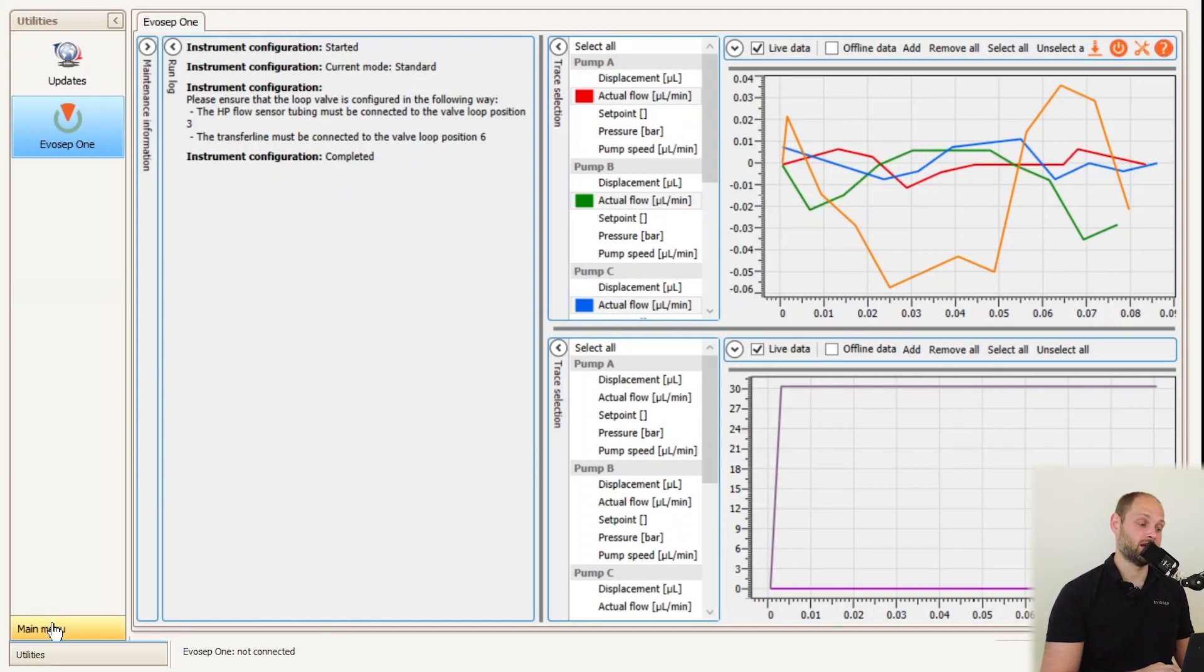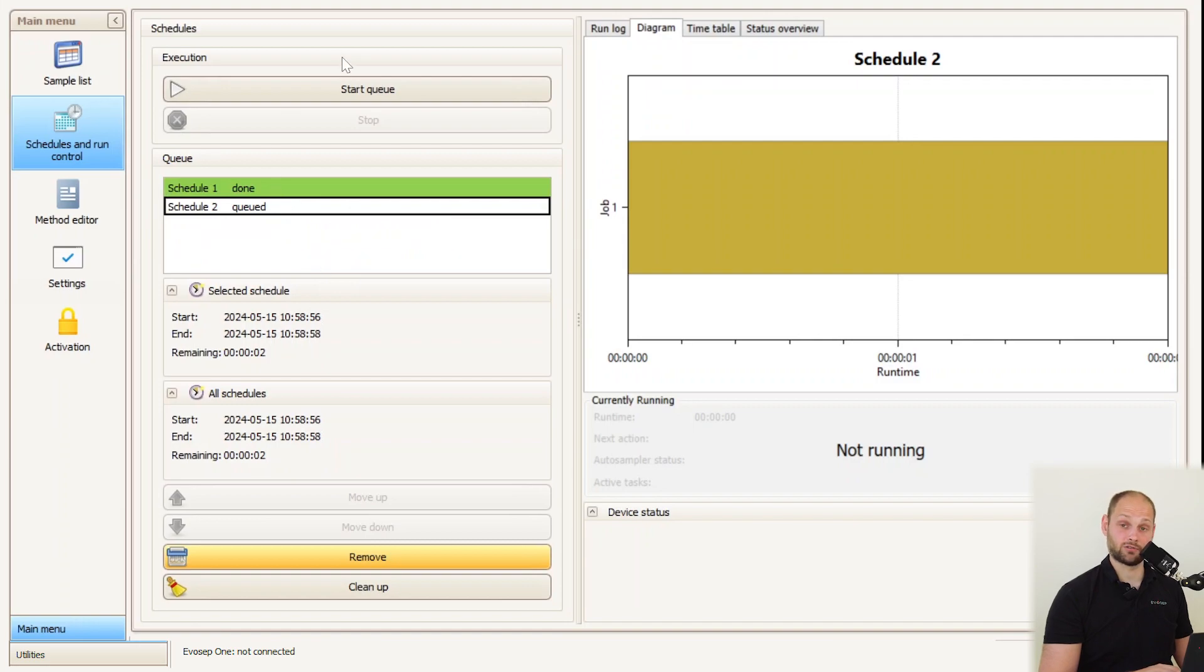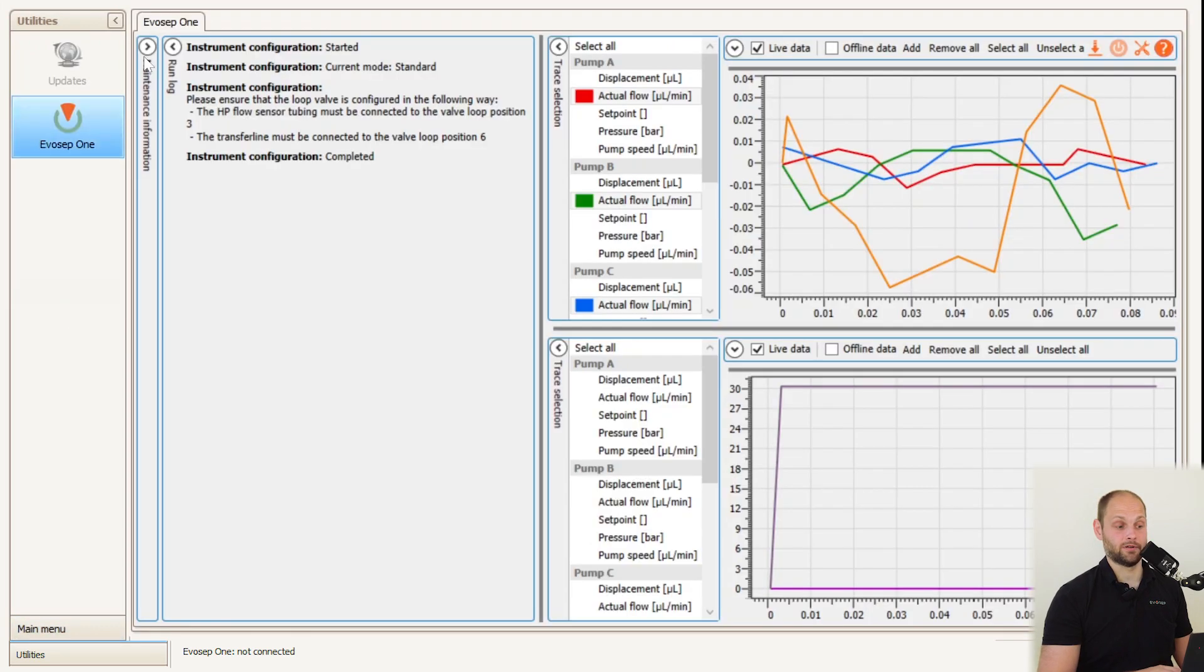To do this, we navigate back to the sample list and our instrument configuration menu, but instead of selecting show current, we navigate to set to zoom. Here we'll create it again, navigate back to the run control menu, run the new method, and then back to the graph viewer.